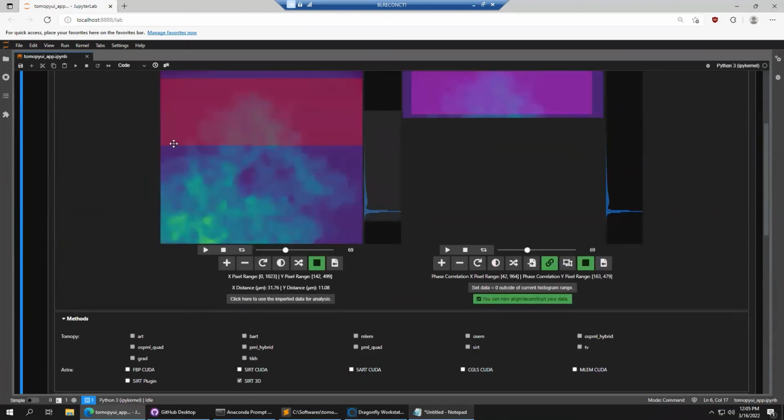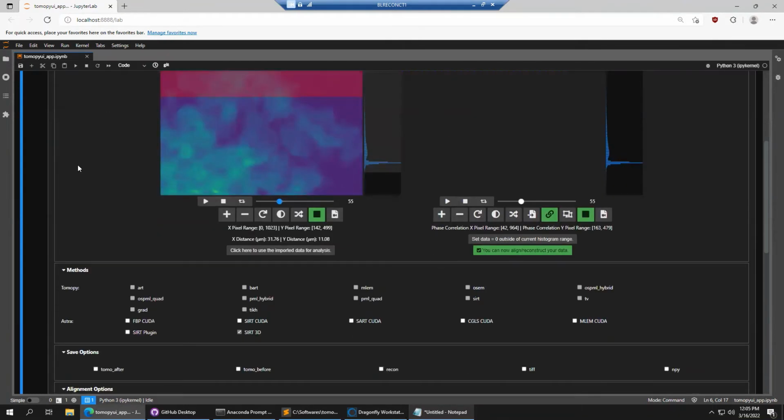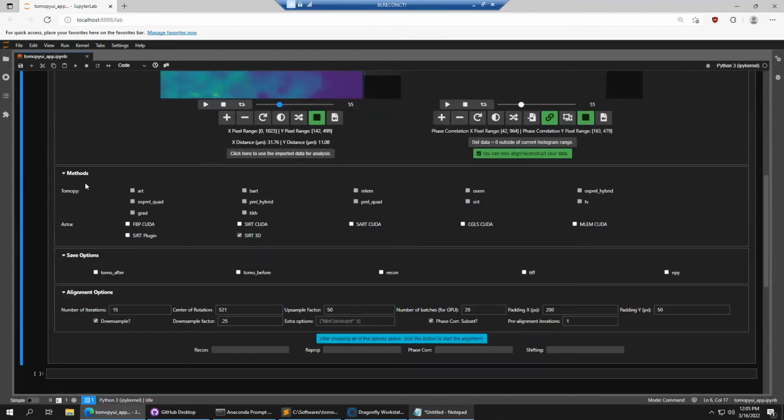So this will basically just look more blurry. Each of these images will look more blurry because they are just lower resolution. Blurry or pixelated? Well, more pixelated. I think it's some kind of bicubic interpolation that the downsampling does. Okay. Yeah. So in effect, it will be more blurry.